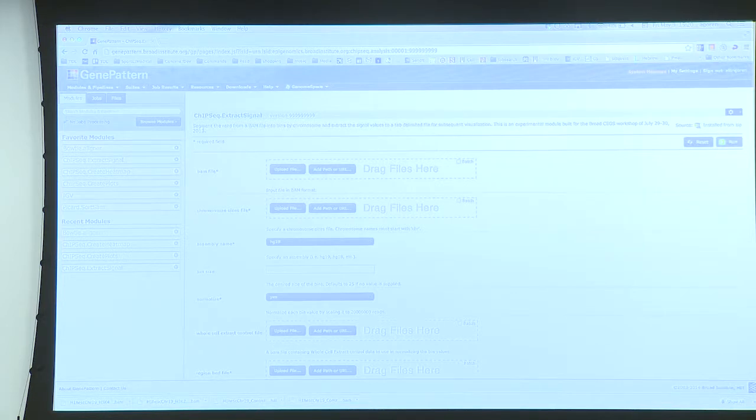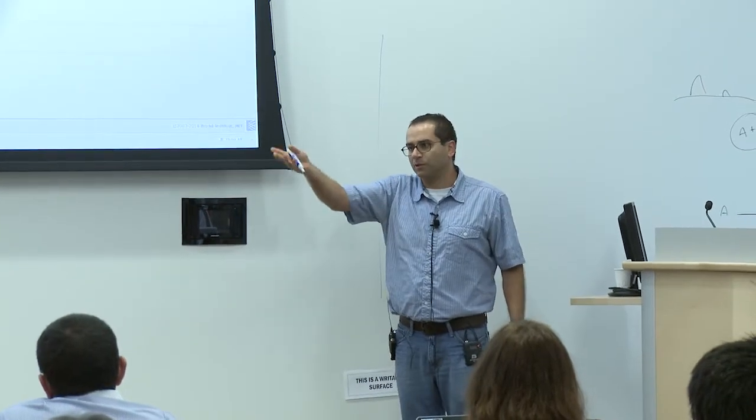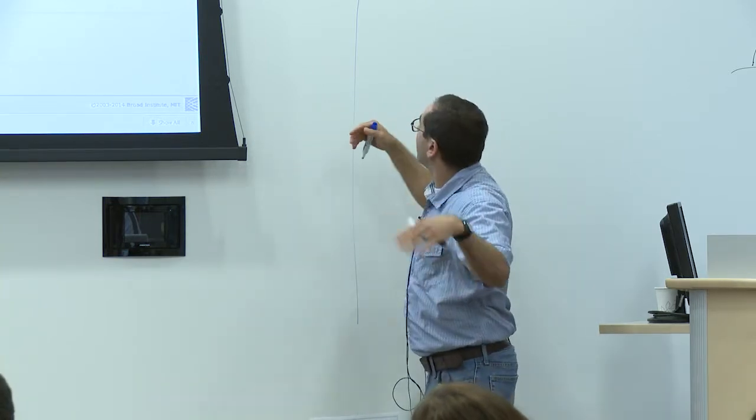in general, what we're trying to do is somewhat similar to what you do in IGV. We start by taking the entire chromosome. So this script should run on all chromosomes. And this is why it requires the sizes of the chromosomes, because different organisms have different lengths of chromosomes. So again, we have only one chromosome, so it doesn't really matter in our files.